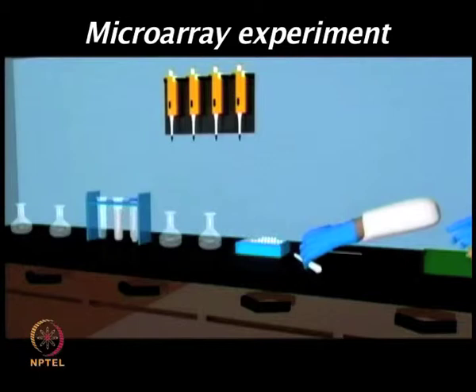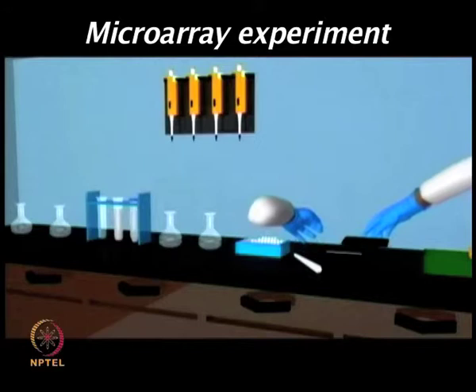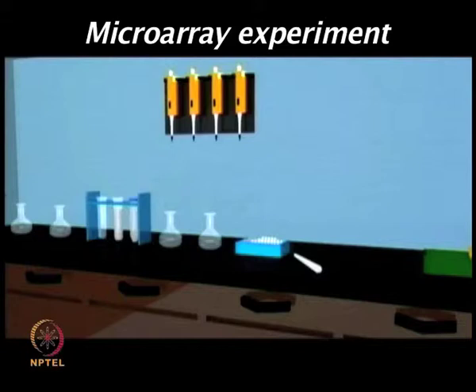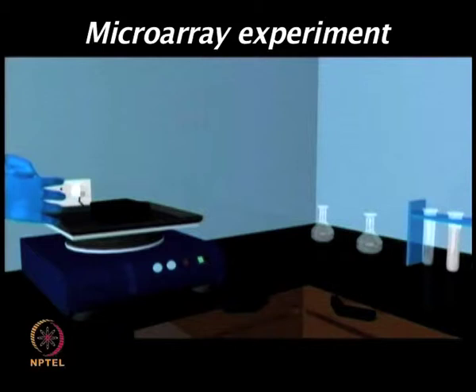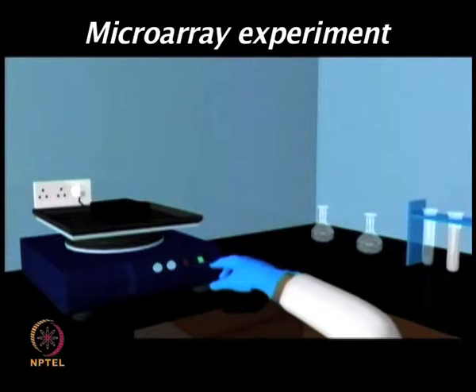A small pipette tip box even can be used for this purpose, where you can add the super block or the blocking solution and then immerse the slide. One needs to ensure proper shaking while performing the blocking experiment. You do not want the milk or the blocking reagents to be dried on the chip surface. So it has to be very uniform and gentle shaking.